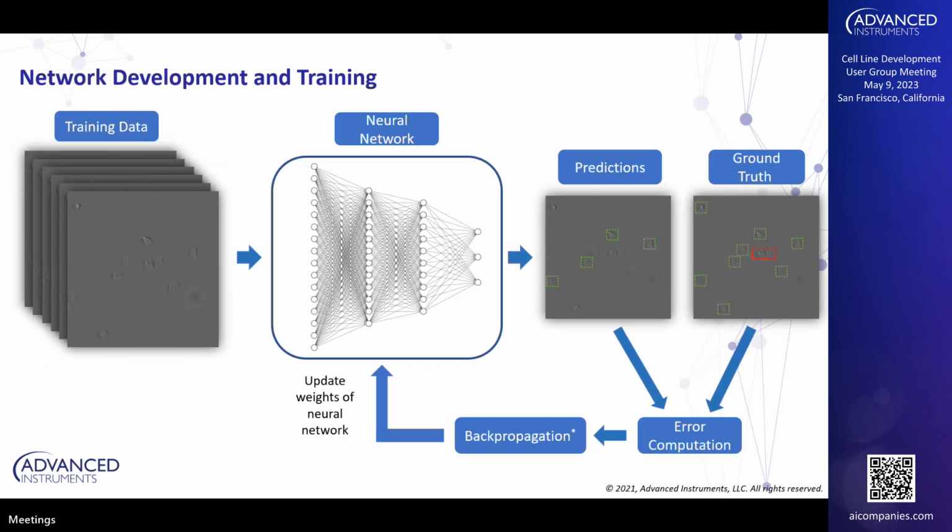And here's another slide stating exactly that. We have a bunch of training data that's being sent through the network, which is the stack here. It's passed through, and it produces what it thinks is the correct classification. Ultimately, sometimes it misses, and then the error and the loss is calculated and fed back through the network via backpropagation to create those minute tweaks that will ultimately lead to the correct classification down the road.